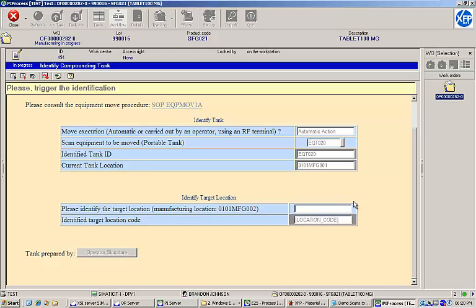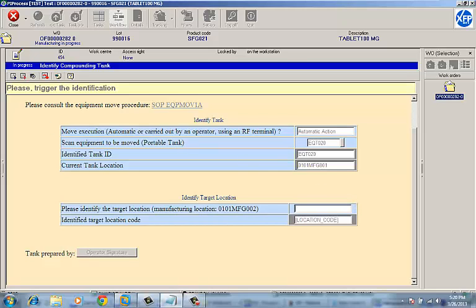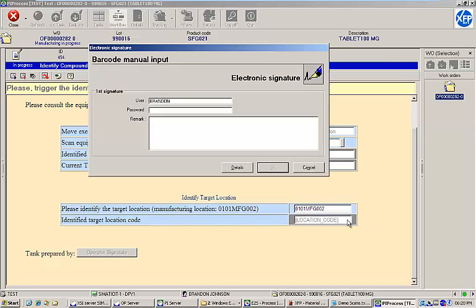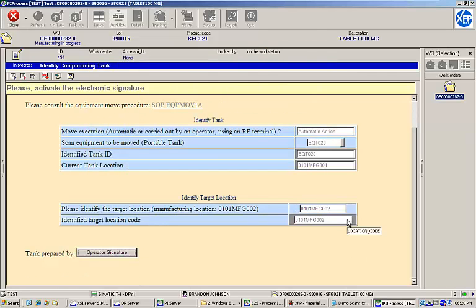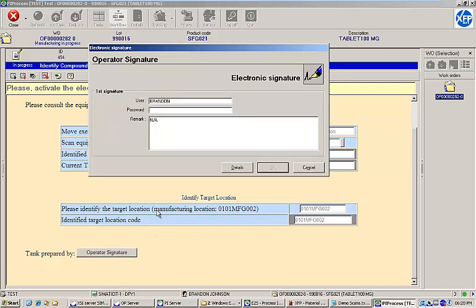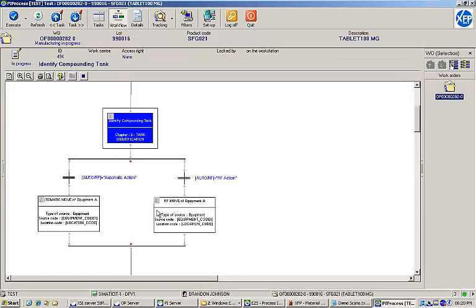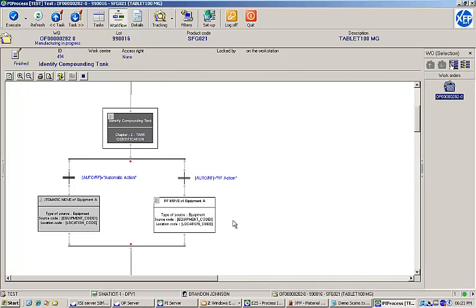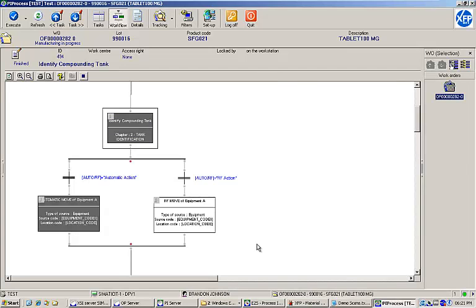The next task is to identify the target location to move the tank. I'll choose manufacturing location 2. Finally, I'll provide my username and password to record an electronic signature. You can see that since we chose to automatically move the container, the EBR automatically executed the move using the left-hand workflow path and then moved on to the next task.